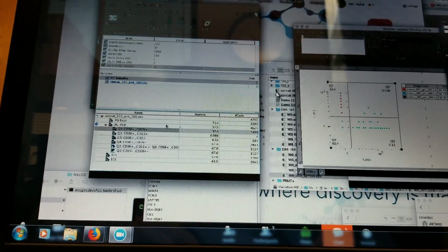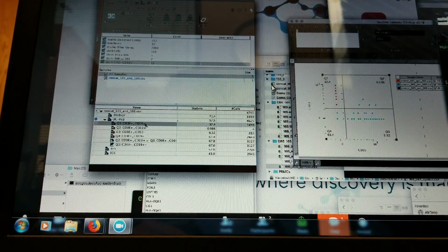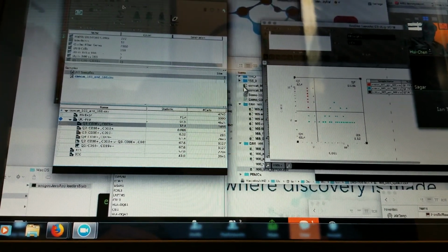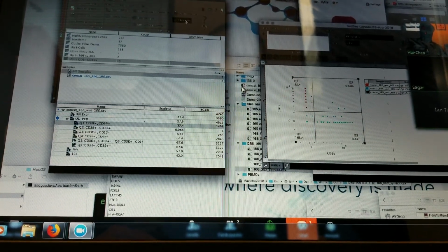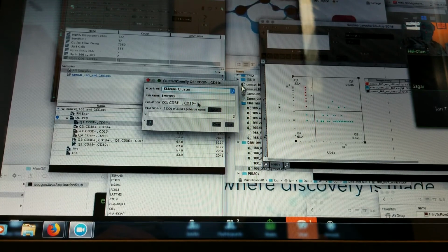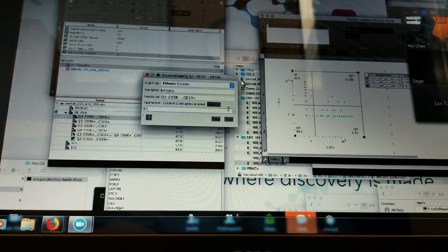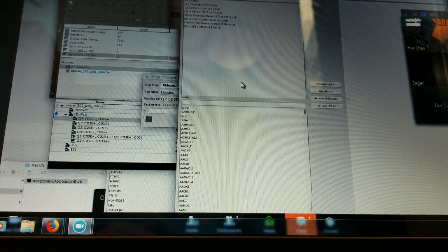Select our B cells data here. So we think these are probably a lot of, if not most of, the B cells in this data set. And then we go to the Analyze tab here and run the clustering algorithm and maybe try and define, I don't know, 5 different clusters of B cells based on our principal components that we already calculated.